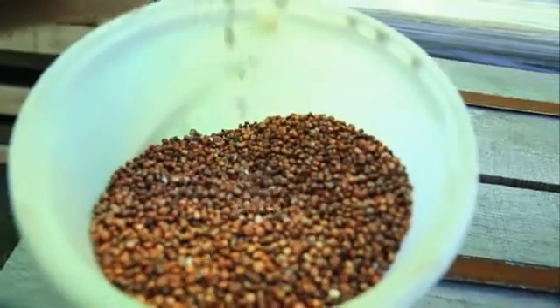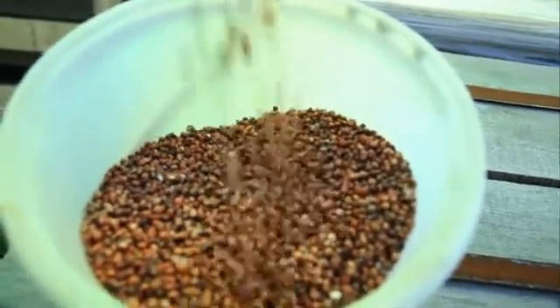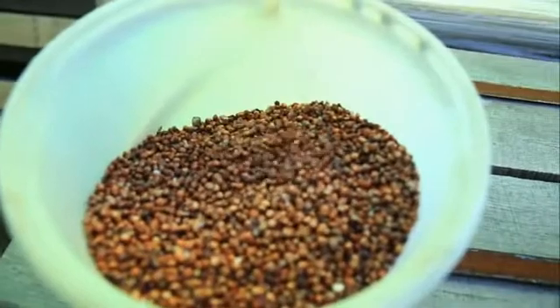Good measurement starts with good sampling. Any measuring instrument will only measure the grain that you put into it, so it's important to ensure that your sample represents the parcel of grain that you're making a decision about.